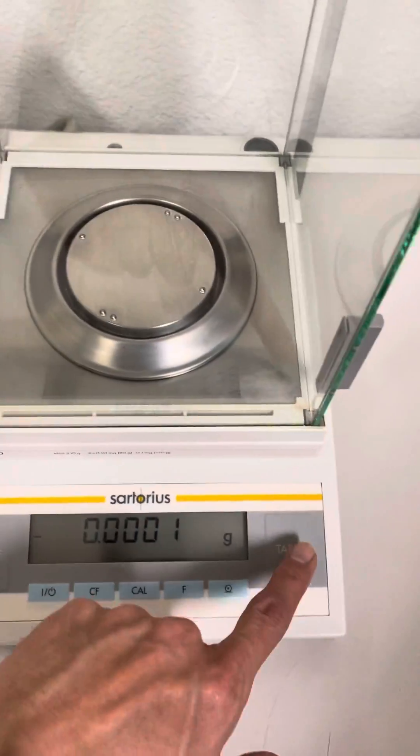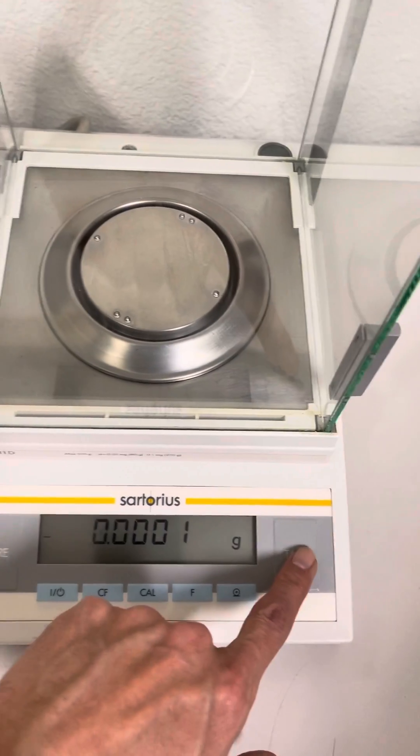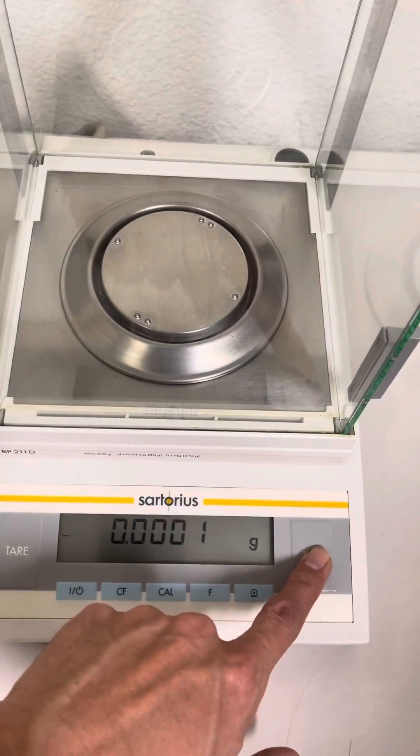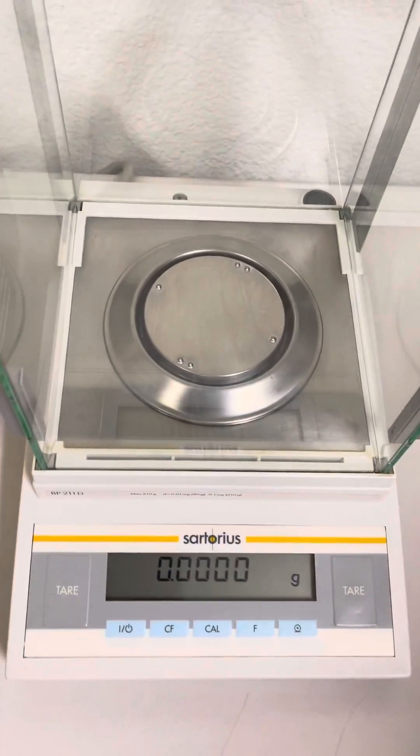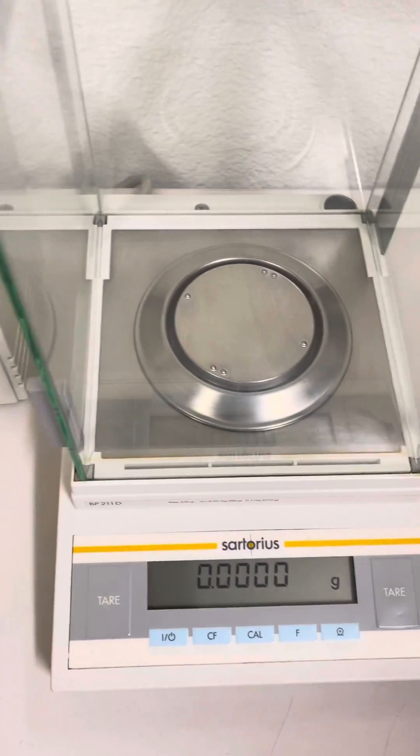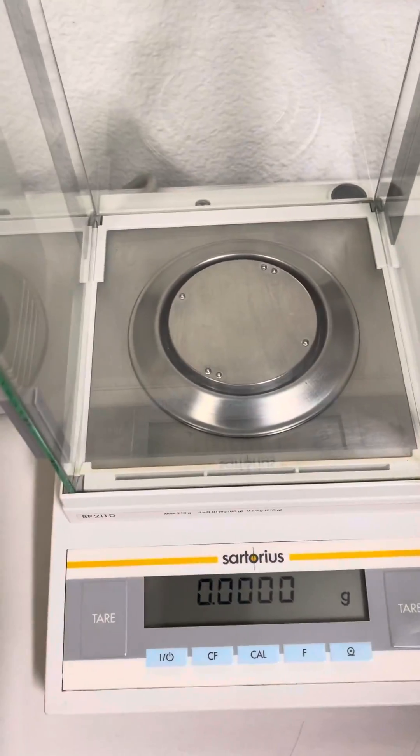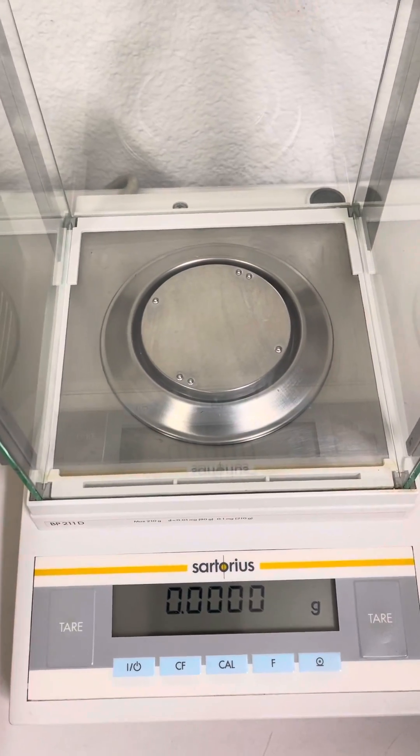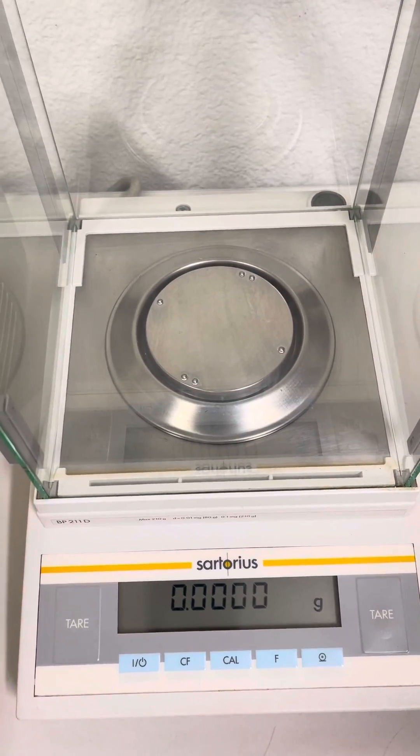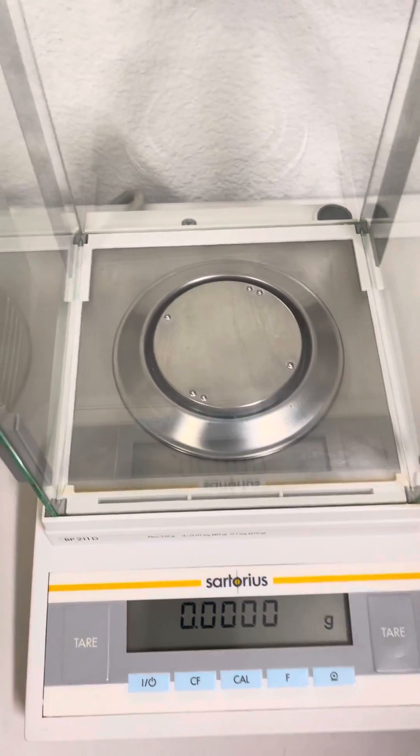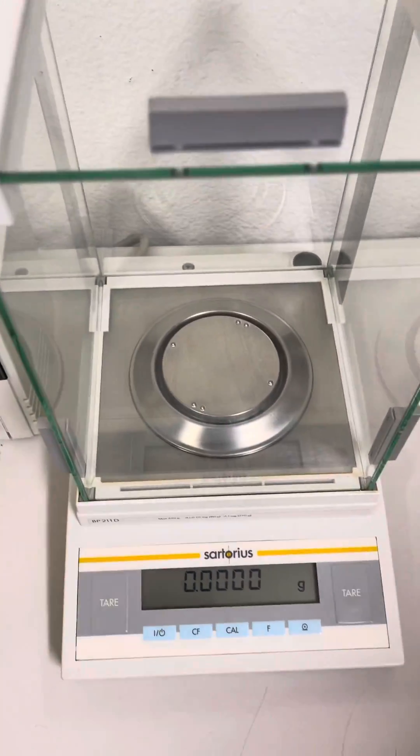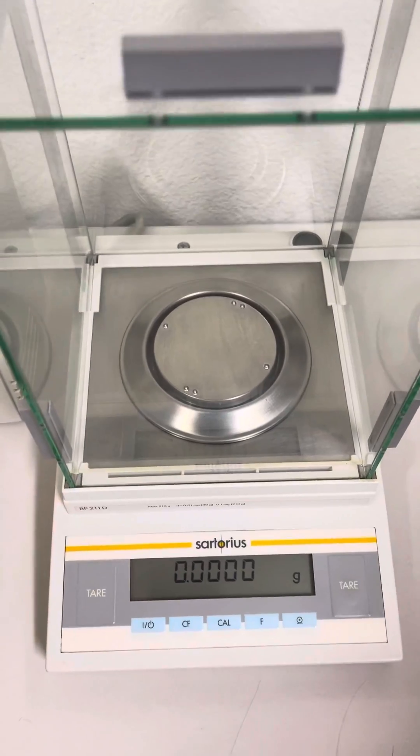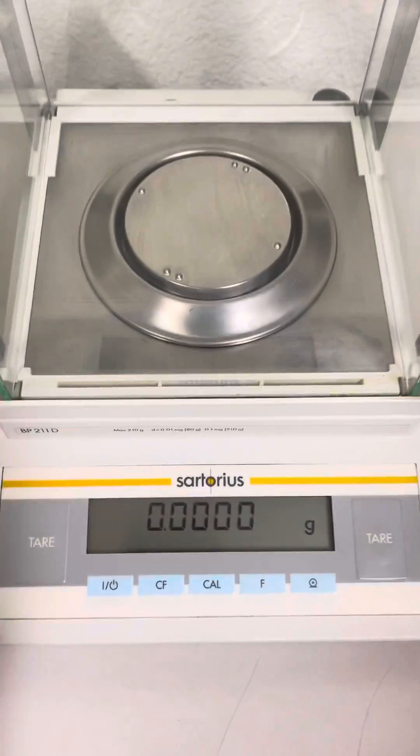It could be something from my hand - dust, dirt, maybe skin, I don't know - but you can see the scale detecting it.